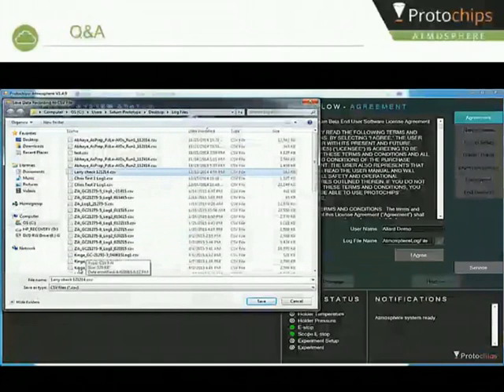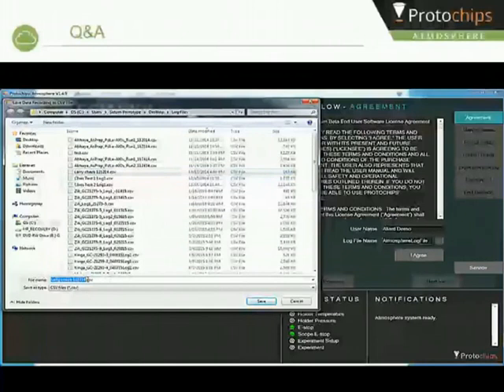I'll begin with a question to John. We have a user who works with steel samples, and they mainly do FIB sample prep. They want to know, is Atmosphere compatible with FIB sample preparation techniques?